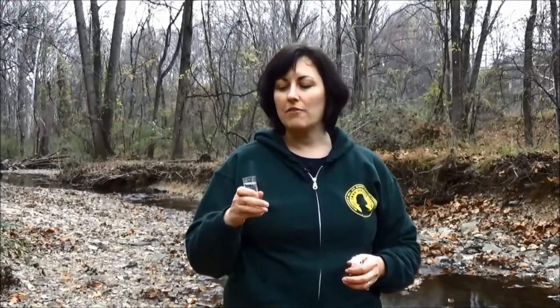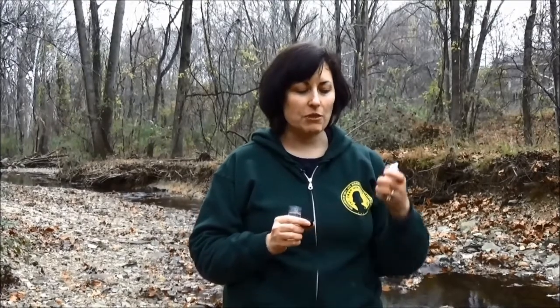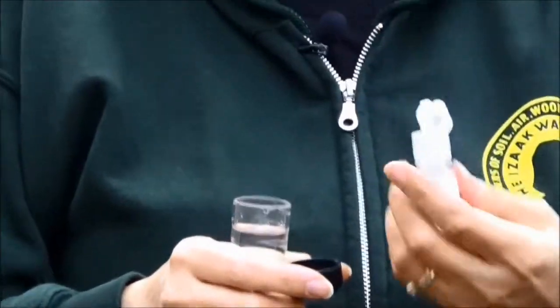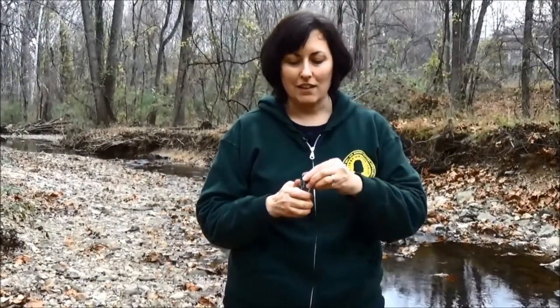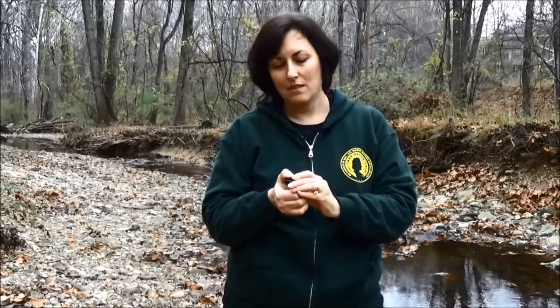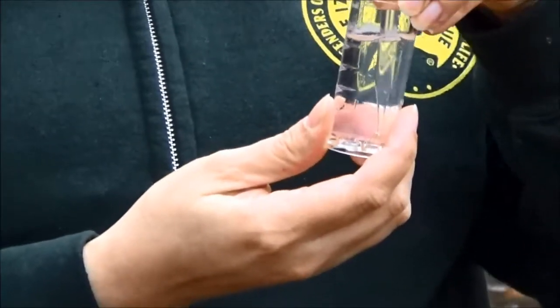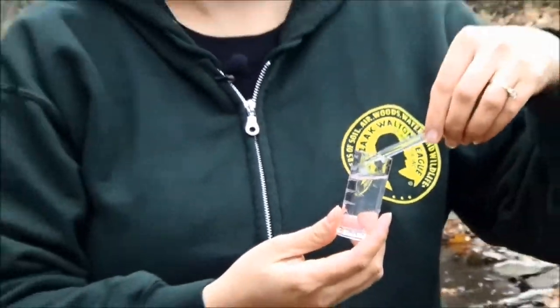Now we're going to measure phosphates, which is another common nutrient that you can find in streams. We have our sample of 25 milliliters of stream water. The first thing we're going to do is put in two drops of our activator solution, then close it up and shake it to make sure it's well mixed. Once the activator solution is thoroughly mixed, we're going to break our ampoule in the sample — just like with dissolved oxygen, hold it against the side and push until the ampoule breaks, then turn it up and down to mix. We want to time this reaction for two minutes to get our reading of phosphate.